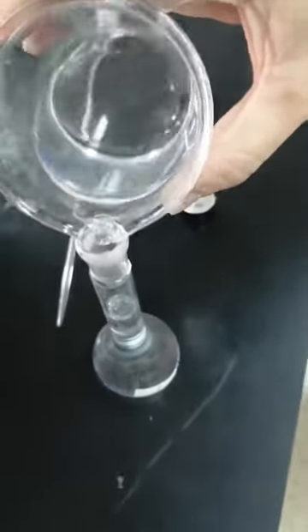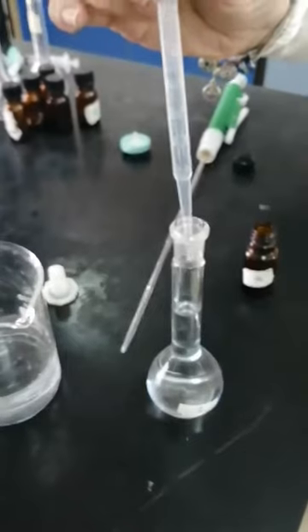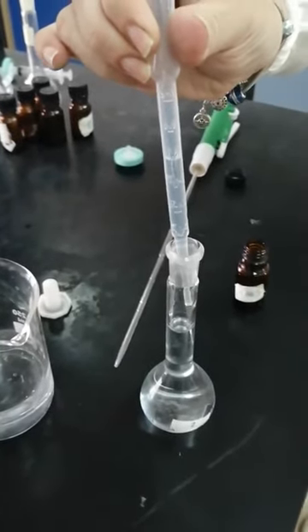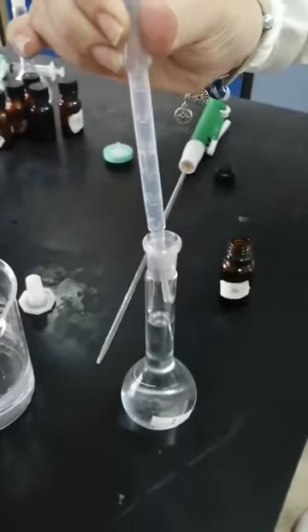My sample is diluted in order to enable me to measure it using UV and get a value between 0.2 and 0.9 as the absorbance value.